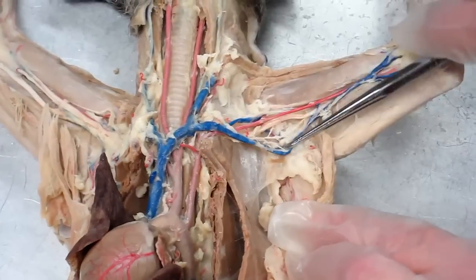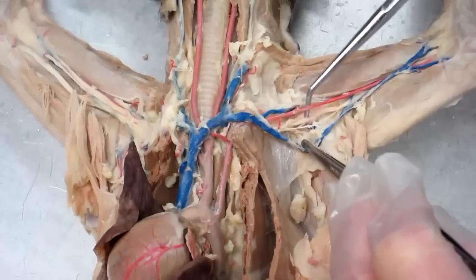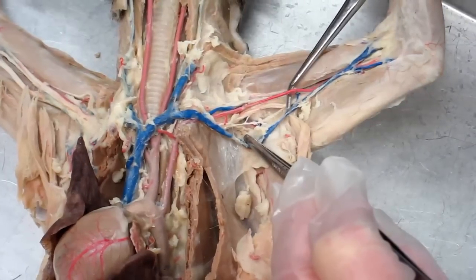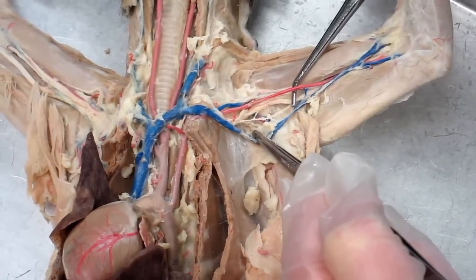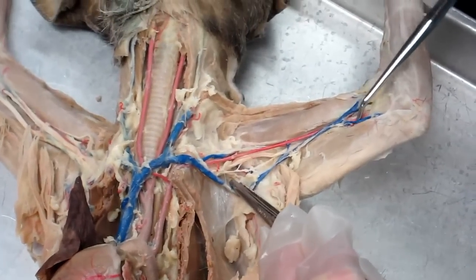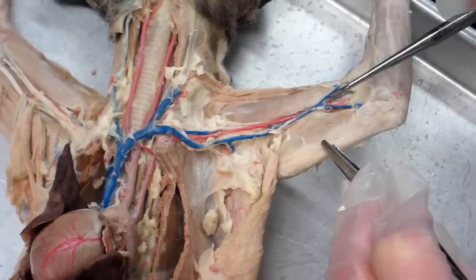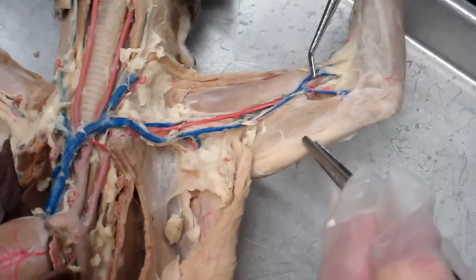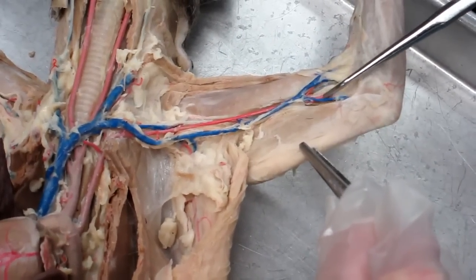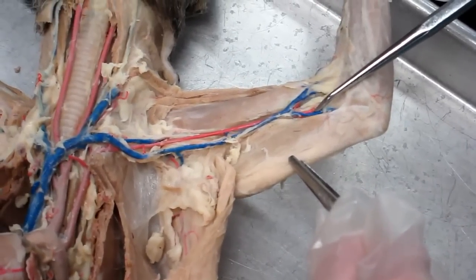As we proceed laterally, move that vein out of the way. It's again the same vessel. When we get next to the biceps, we would call this the brachial. Okay, and then as we continue to the elbow, you can see that this vessel divides into two branches. The one on the thumb side would be the radial. The one on the pinky side for the cat would be the ulnar.